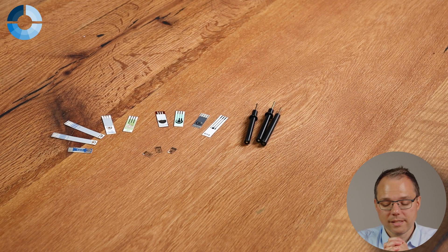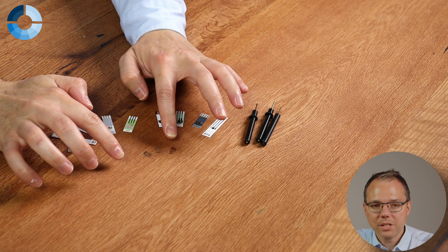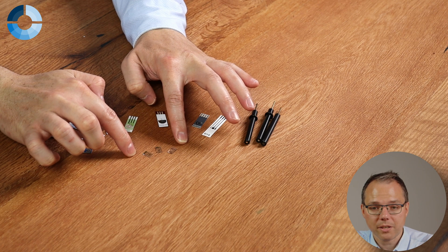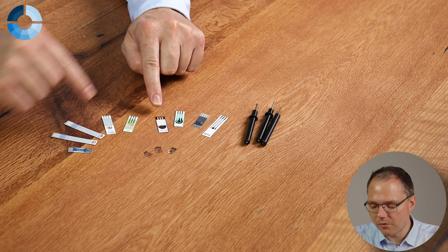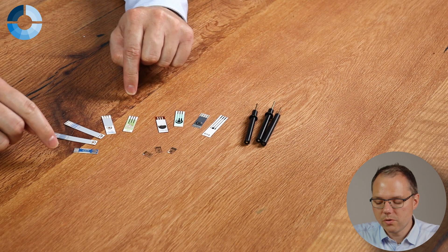There's also a third type of electrode made by some companies. For example, these tiny electrodes from Microx are metal deposited on glass by vapor deposition — the glass slides are placed in a vacuum, a metal is heated until it becomes gaseous, and because the glass is cooler, the metal deposits onto it. This produces a thin metal film that behaves more like a traditional metal electrode, though not always 100% the same. Companies like gsense and BVT also use some form of vapor or thin-film deposition.